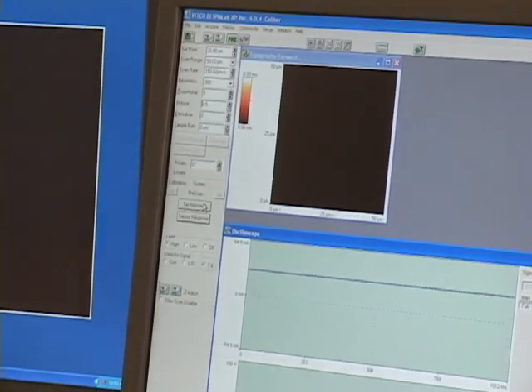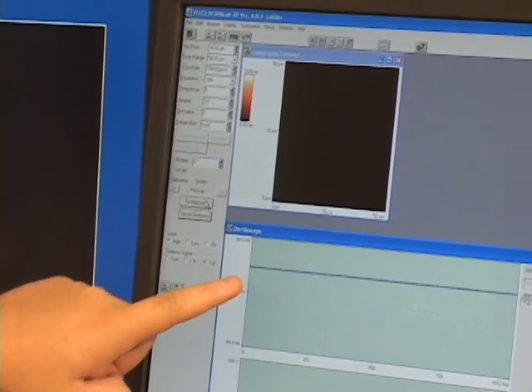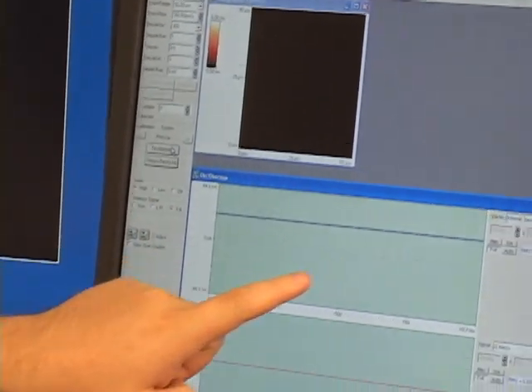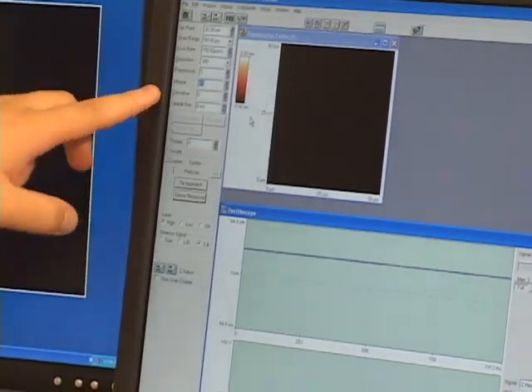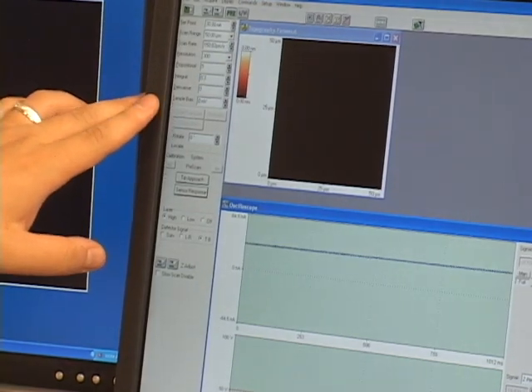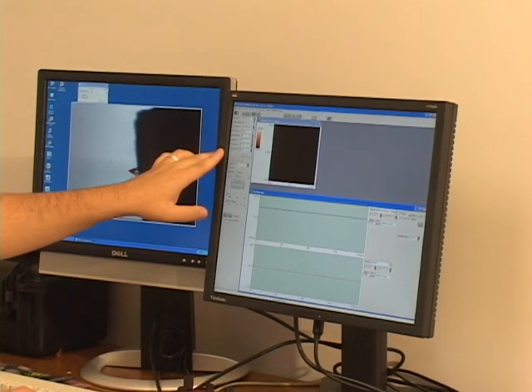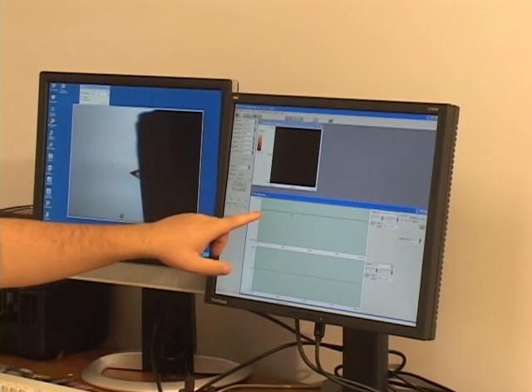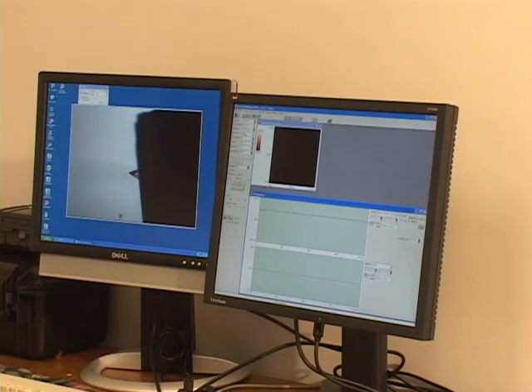All right. As we engage, we see a little bit of noise on our top bottom signal. So you see this. So to reduce that, we'll first reduce the integral gain to like, let's see, 0.3. See if that helps. Not so much. 0.1. And that one helped a lot. So 0.1. Let's try 0.2. Let's see if we can get away with it. Yeah, that's okay. So we're engaged. We don't have that much noise.